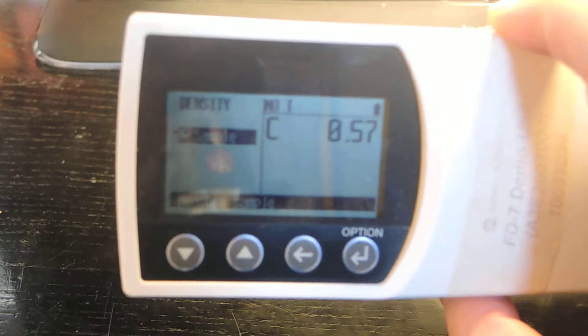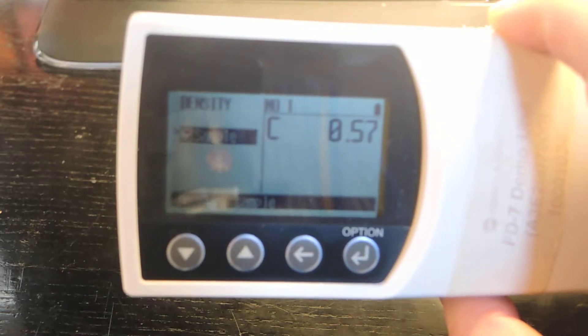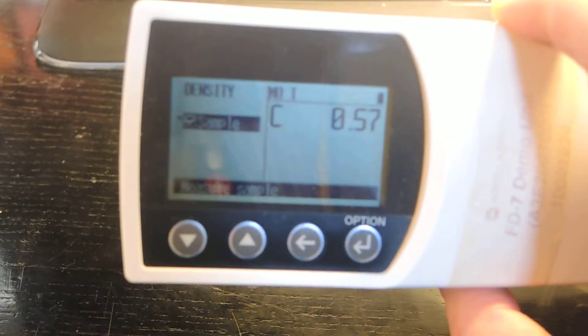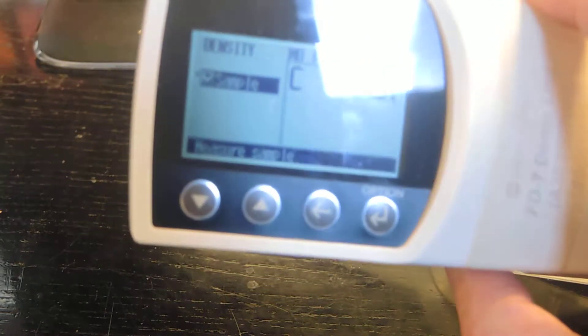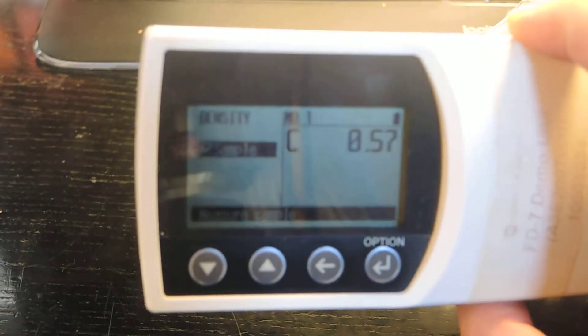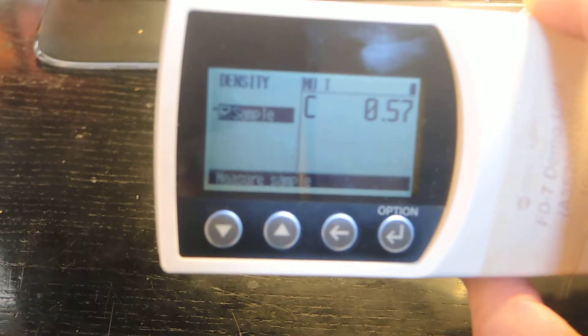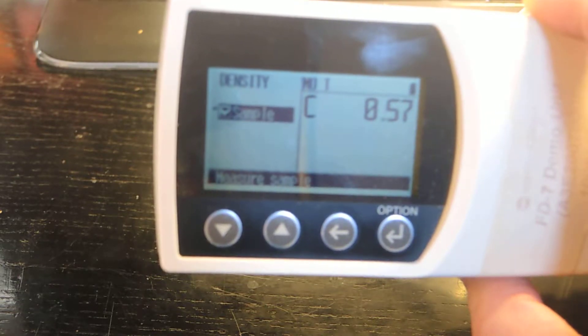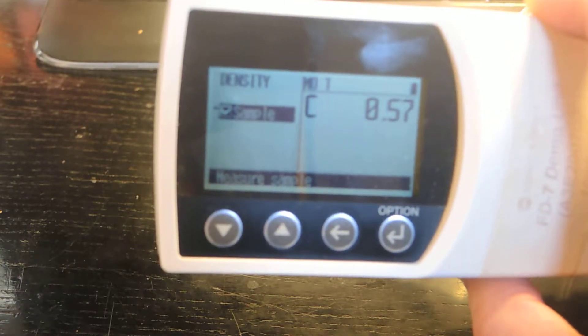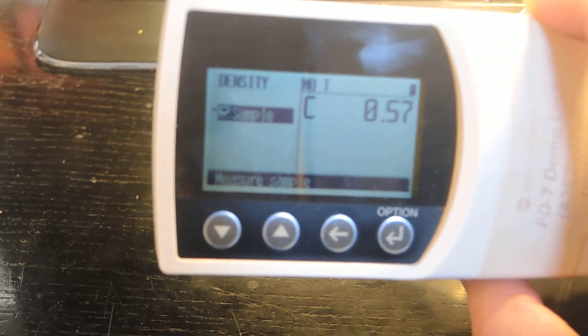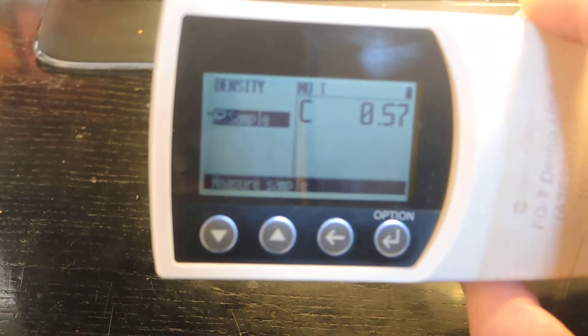And let's see if we can get a density reading. Now let's see what this reads. This reads 0.97, 0.57 actually. And this is the Cyan, it's using the Cyan filter. So it went to the highest density.